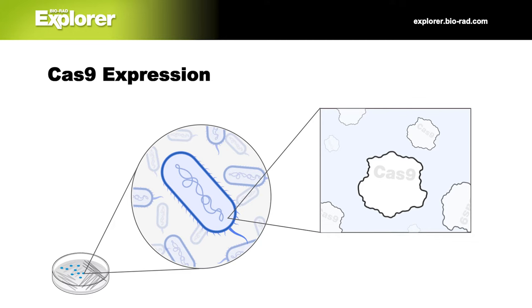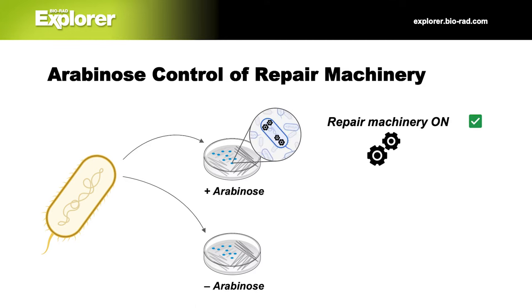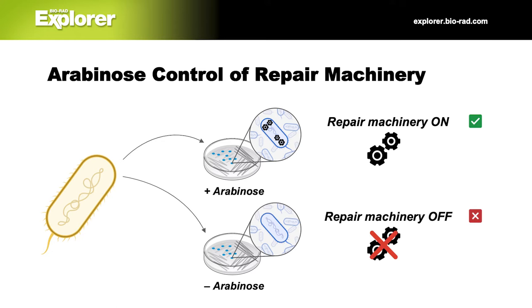E. coli that we're using have been engineered to continuously express Cas9. We also need the repair machinery proteins. We've put the genes for the repair machinery proteins under the control of an arabinose promoter. When starter bacteria are grown on media with arabinose, the repair machinery proteins are made. Without arabinose, the repair machinery is not made.